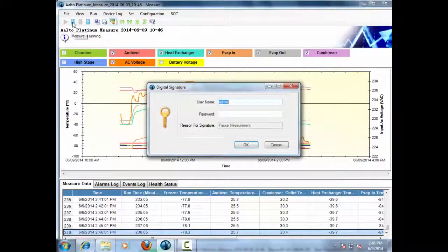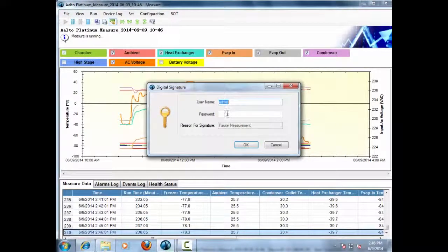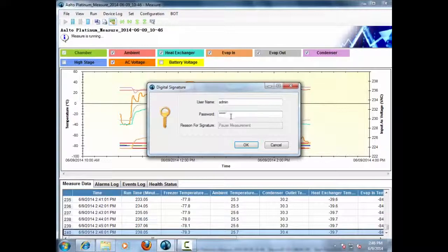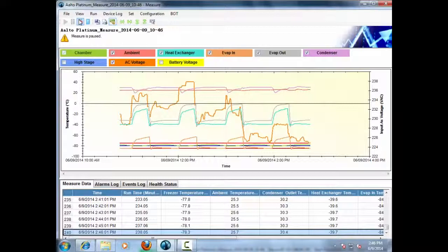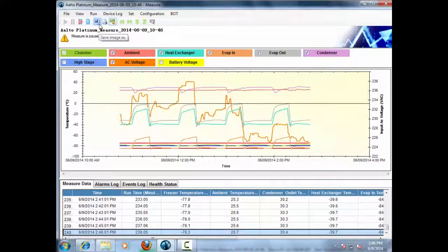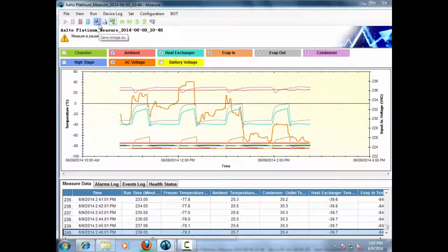Measurement can be paused, stopped, or resumed. The graph can be stored and saved in different types of formats, such as PNG format, GIF, or JPEG format. Actual point values can also be seen on the graph.